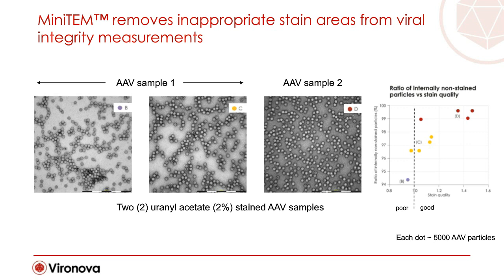On the left image, we see just a little bit of salt surrounding the particles, and the background is quite bright in the direct vicinity of the particles.